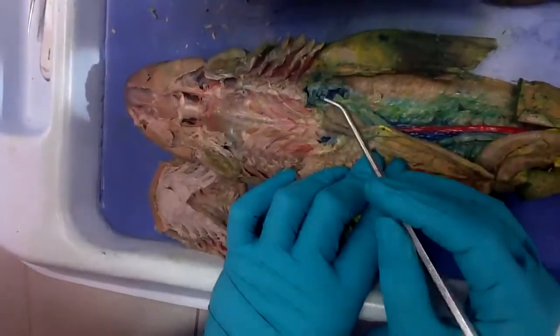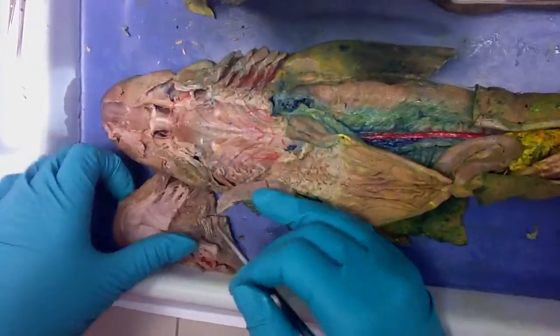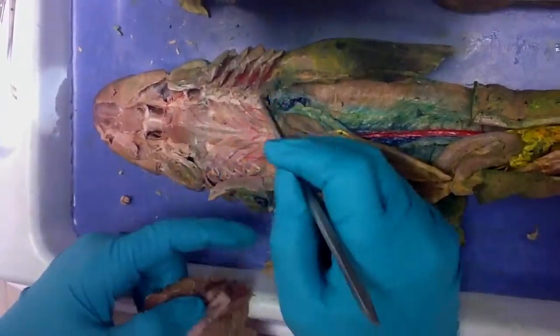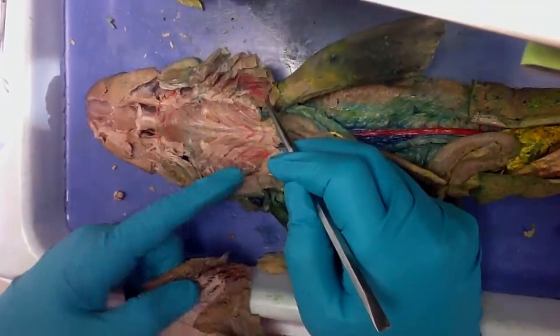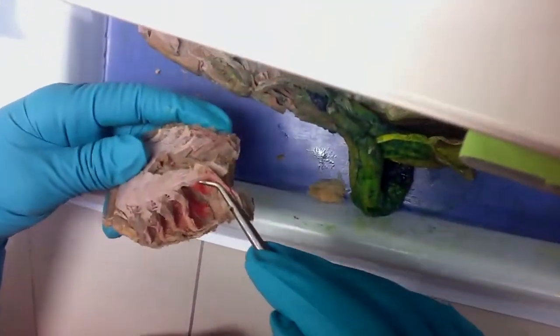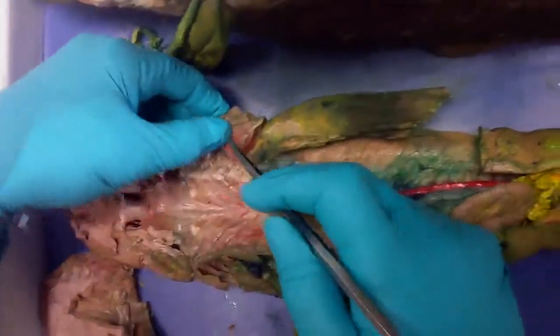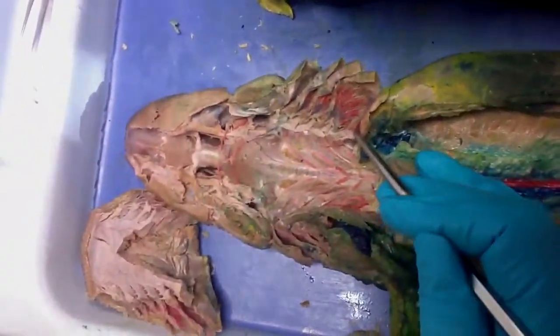Okay. And so we have collector loops where the blood comes and the artery comes and it supplies the gill. We cut it off. You can see it over here. It's a little bit harder to see, but all of this red is part of the collector loop. The diagram's probably a lot better in the book for that.